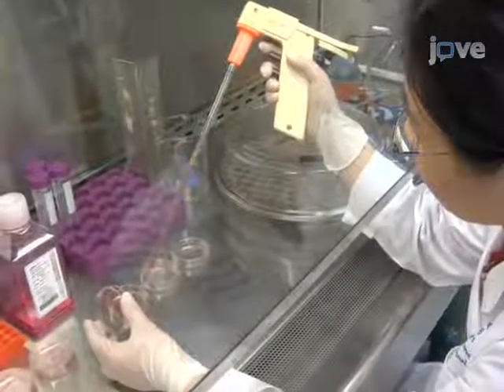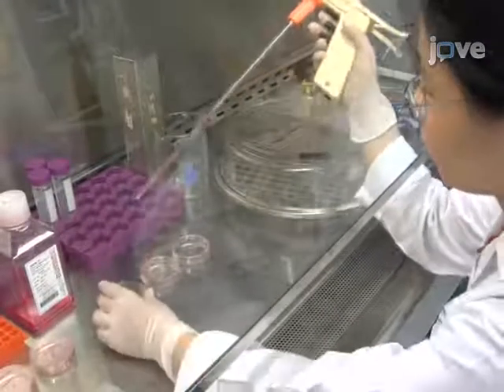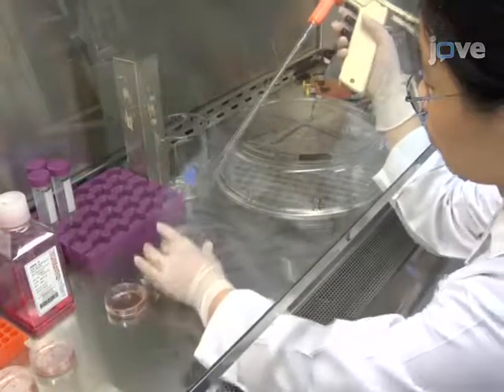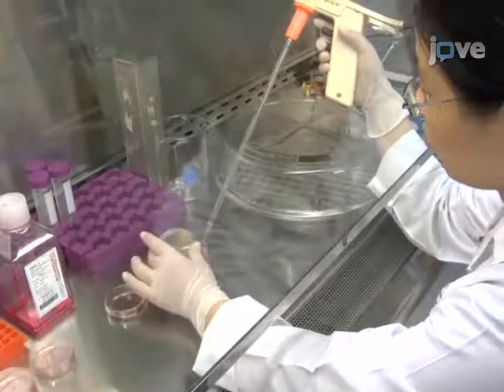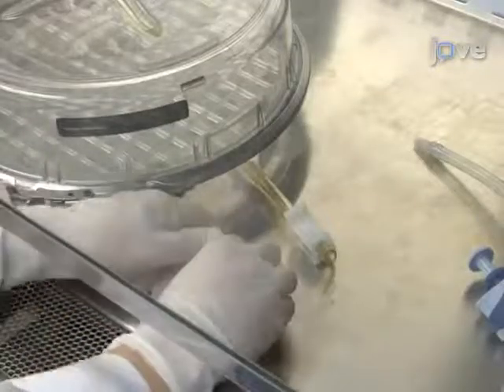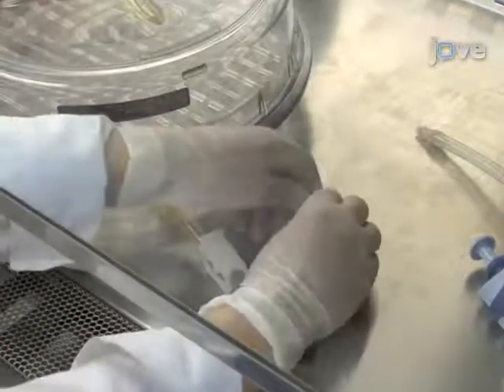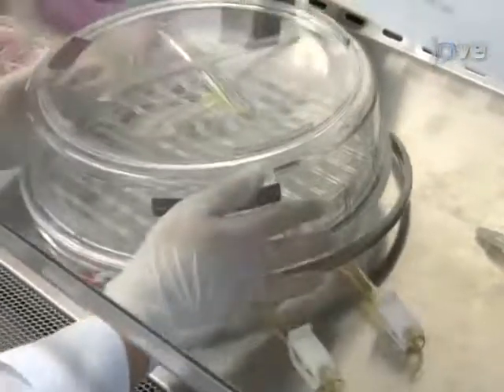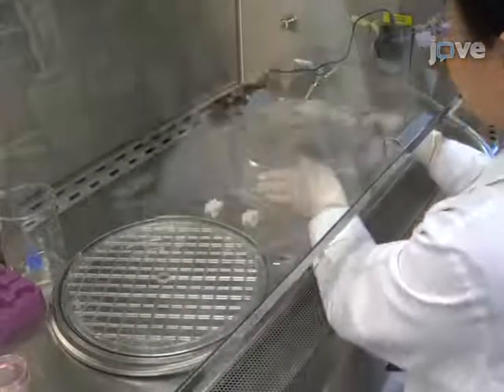To induce hypoxia using a modular incubator chamber, prepare at least two identical cell cultures. However, a triplicate of each condition is recommended. Open the modular incubator chamber by first opening the two white plastic clamps located on the tubes attached to the chamber, and remove the lid and trays.